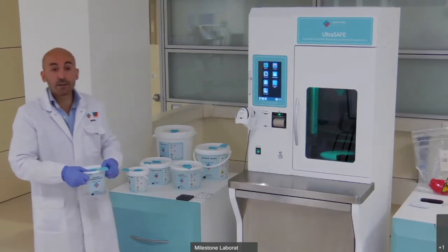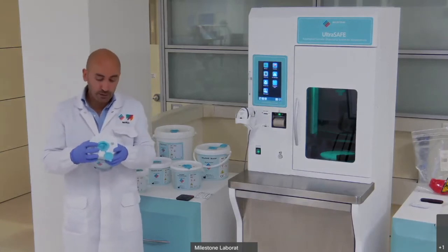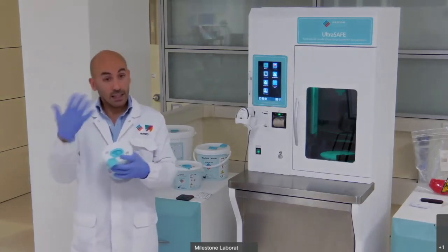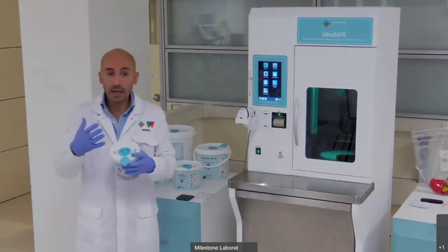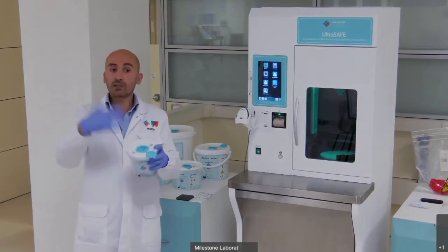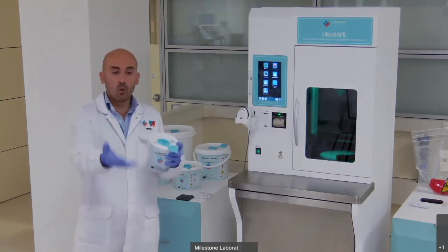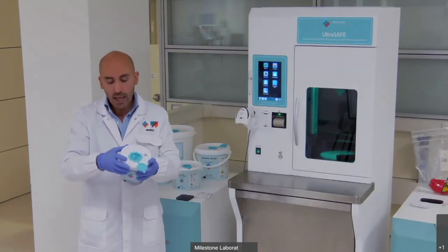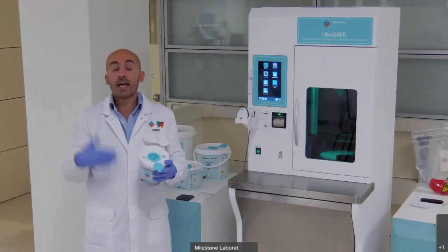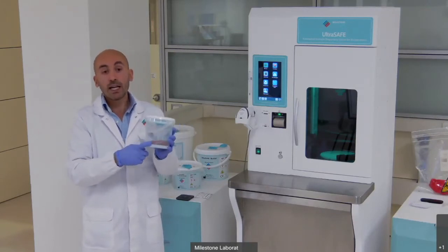One very important thing to share is that in a traditional bucket, in order to pour formalin, the cover has to be removed, or maybe you pour without a cover at all.